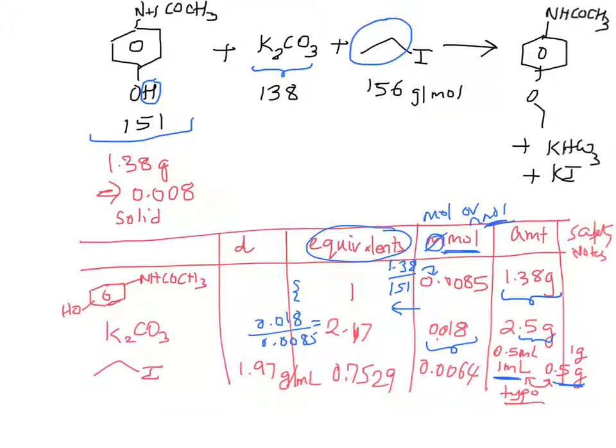So if you would have taken 0.5 grams and you took 1 milliliter, then the density should be 0.5 grams per milliliter, right? So their numbers are off. It really should be 1 gram is what they would have taken, and which amounted to about 0.5 milliliters.